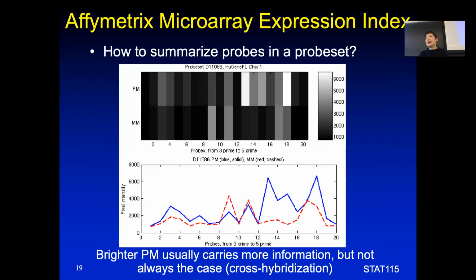This is just in case you have a bubble in the hybridization. You don't lose this whole gene, right? You just get rid of one probe. So they are kind of in different locations. The mismatch and perfect match are usually right next to each other. And so we usually have 10 pairs of numbers or 20 pairs of numbers.